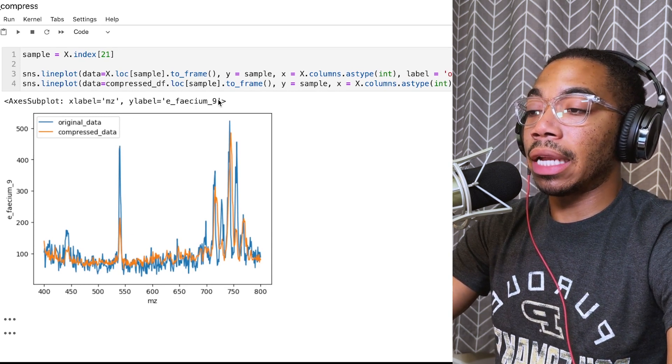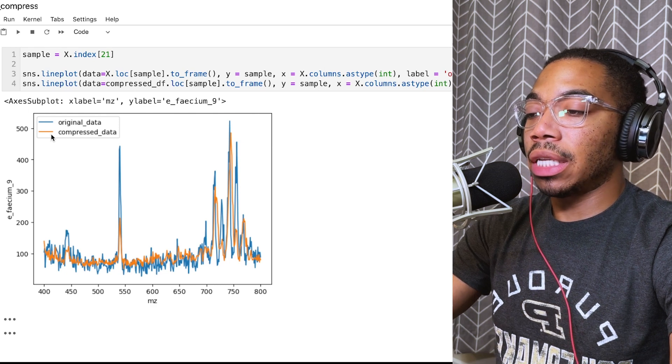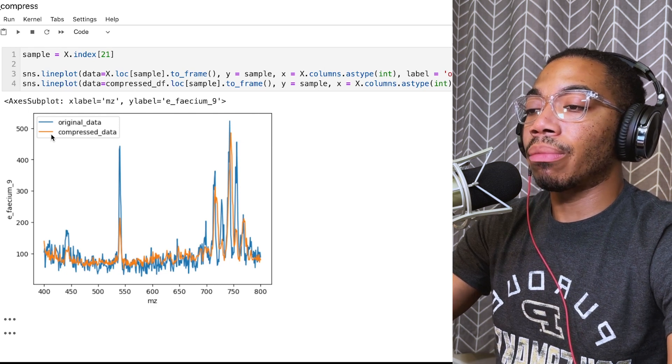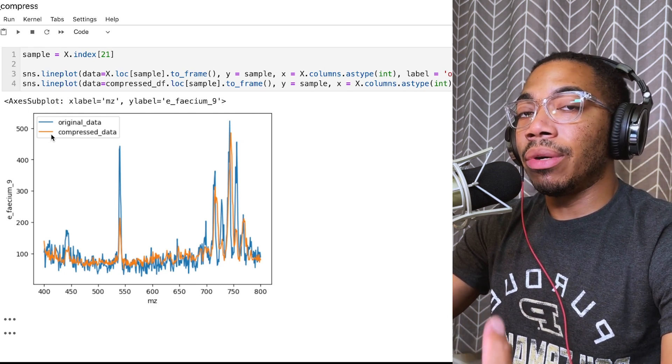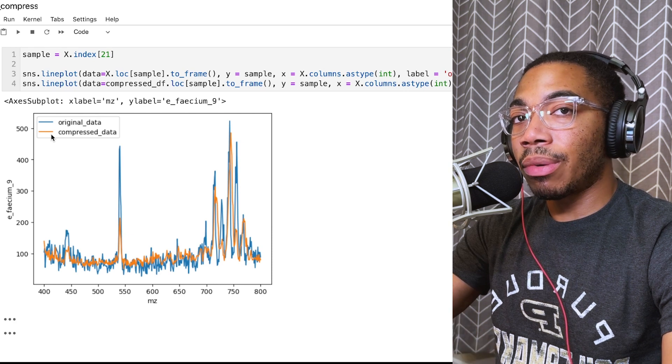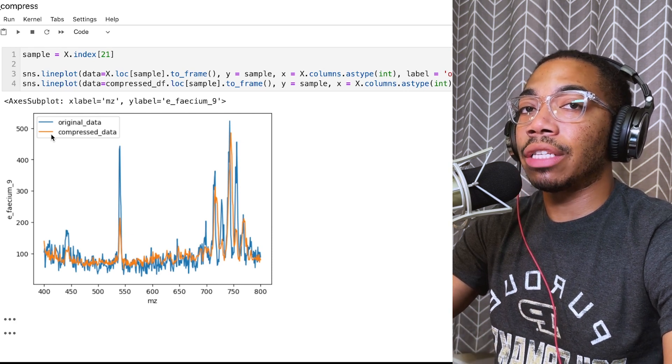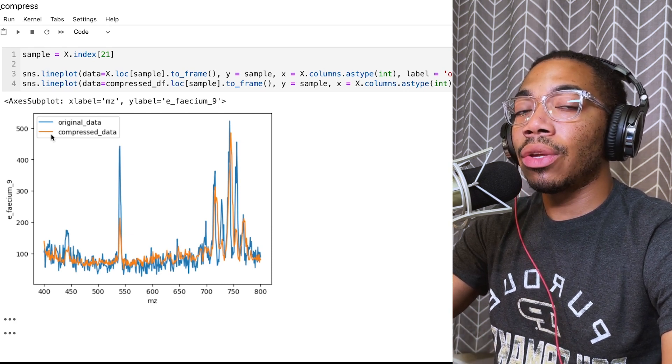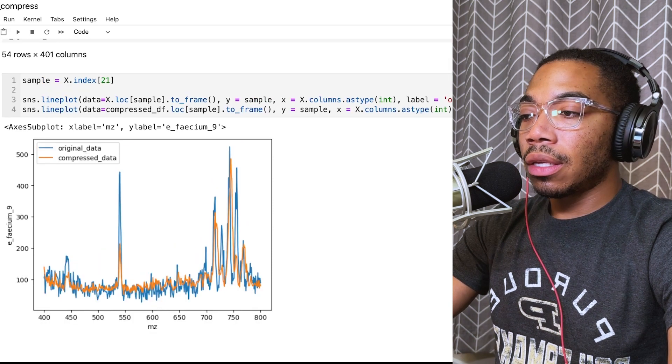The blue plot is the original input X data for a particular sample, this Faecium 9 sample. The orange is the actual compressed data when we build a PCA model using a single component and then use the inverse transform methods to walk back to that original data set.